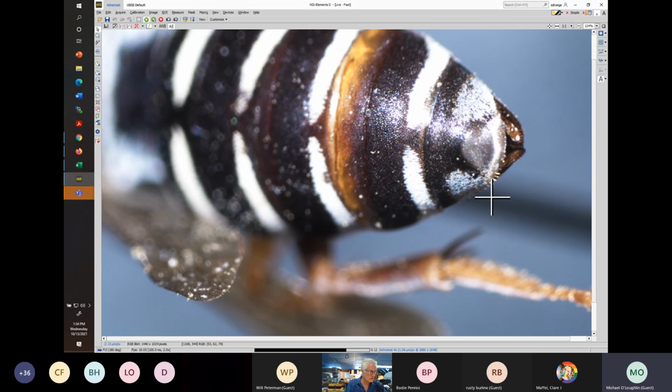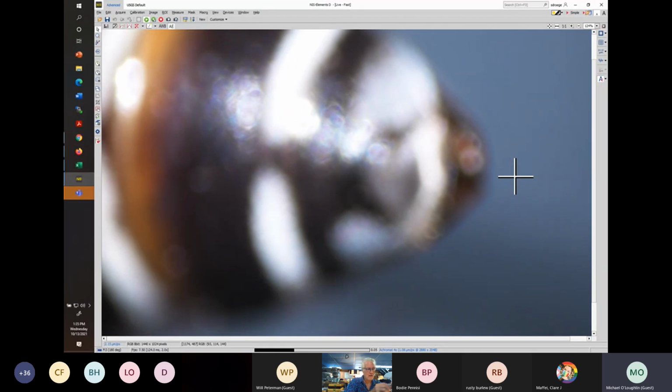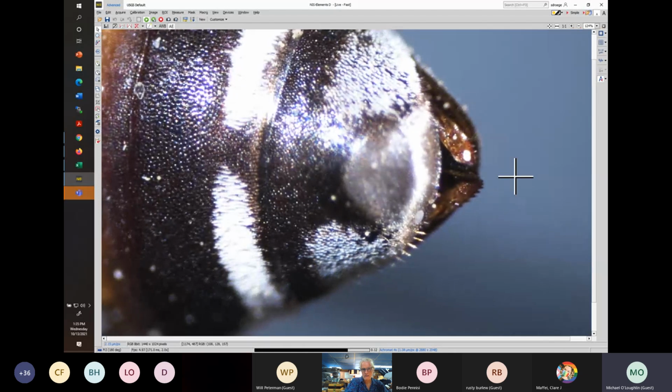It's a larger and whiter looking specimen with, I think, almost no or perhaps no reddish areas. And these are those spoon-shaped projections that are coming out from the abdomen that are the nest cutters. And I think we can see them a bit better here in this place. So here is the expanded tip. Here's the other one, which is lapped by this one.